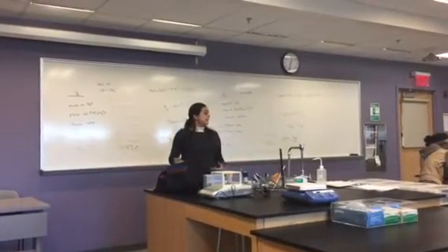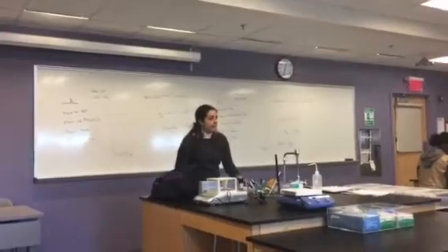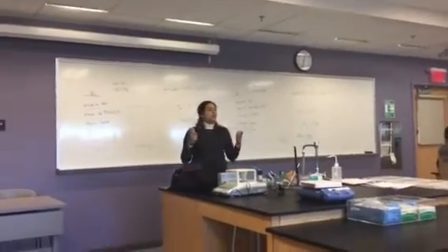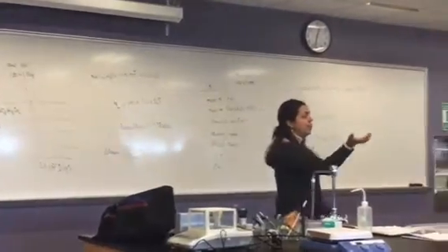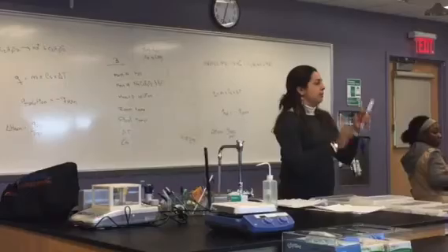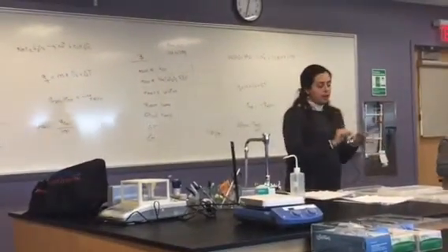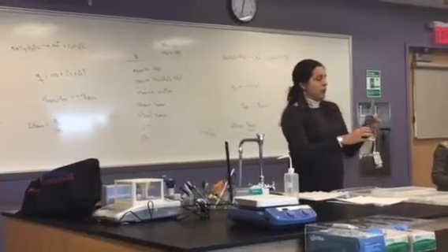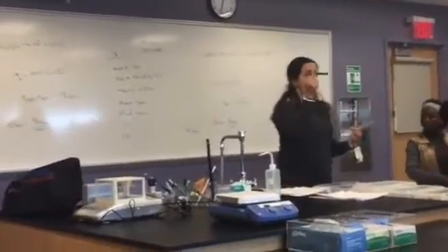We're doing the enthalpy lab. It's a very easy and short lab. For that, we need to gather 2 test tubes. Again, everything is at the back. We can get those thermometers, or we can get our electronic thermometers. Make sure that if you use the electronic thermometer, you plug this into the LabQuest. All right? This is our thermometer.